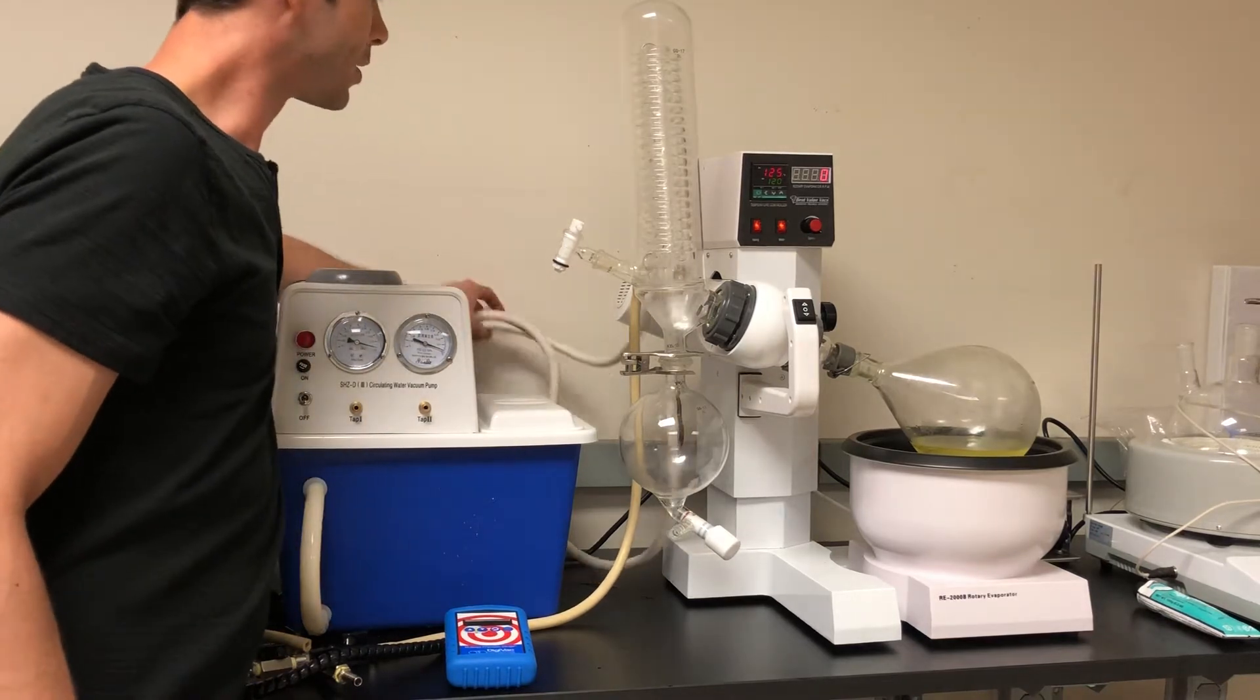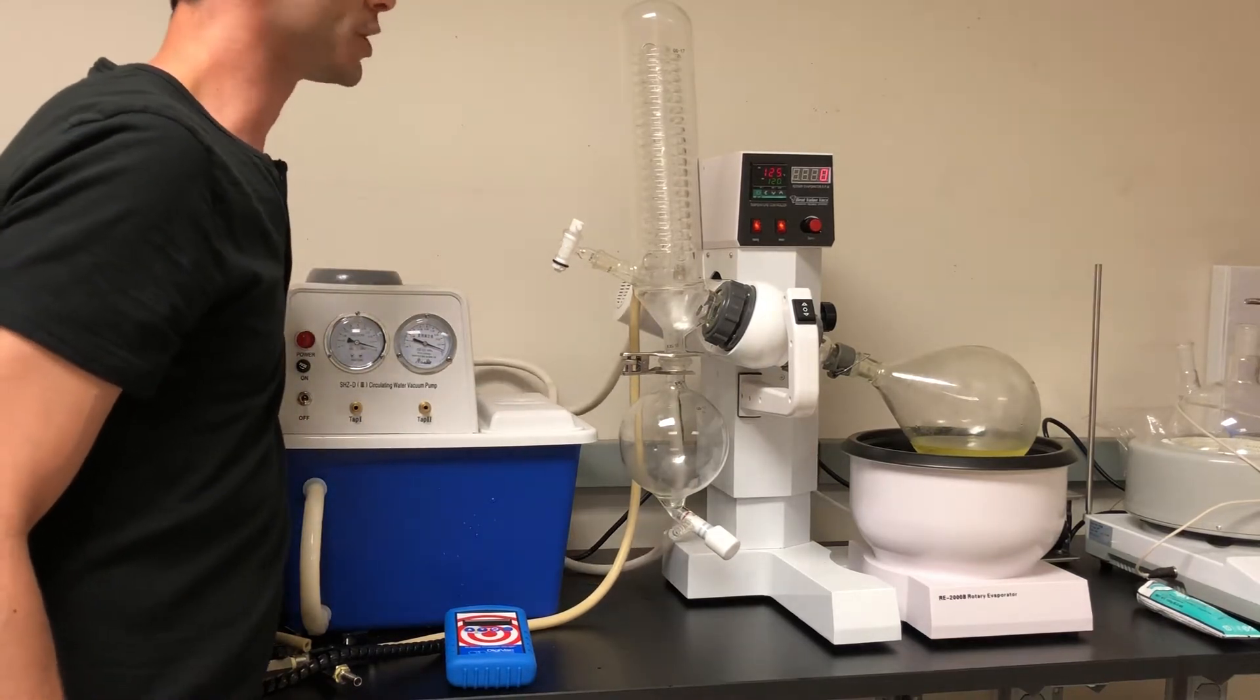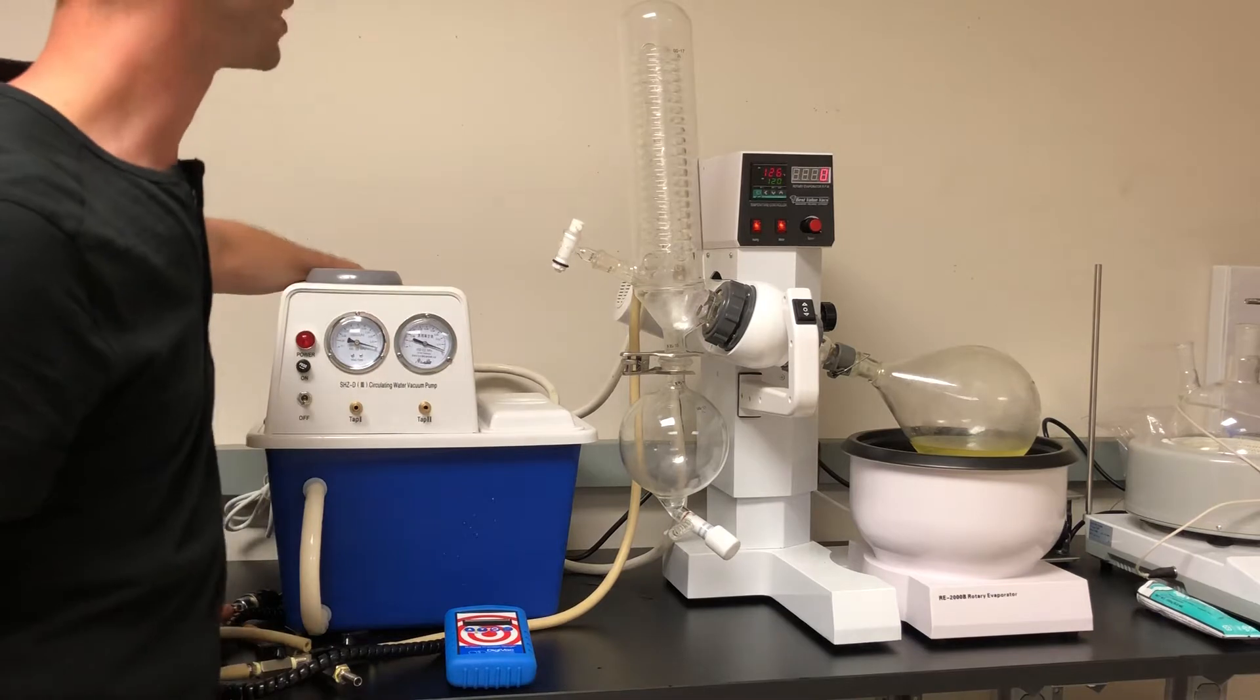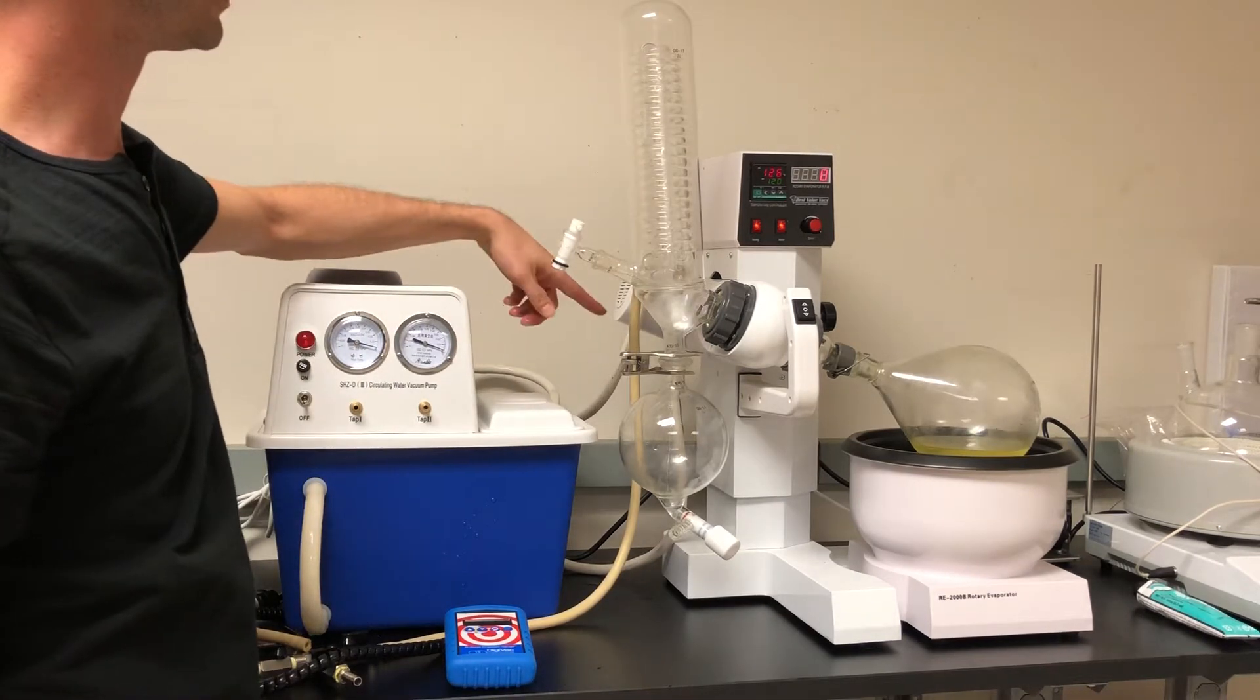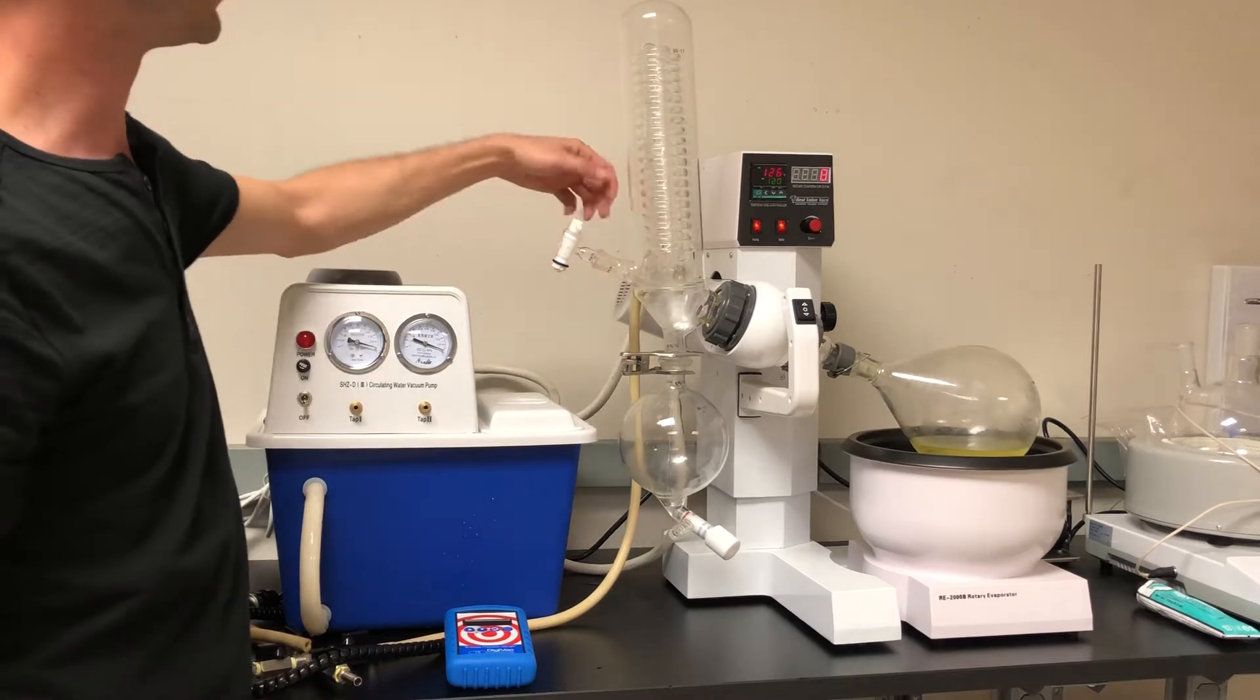It's got two hoses that are connected to the back here. It doesn't come with much hosing, it comes with a little bit, so you're gonna have to supply a little bit of your own tubing. But there's two fittings in the back, one that'll go to the top, the output, and the inlet that'll go to the bottom of your condenser.